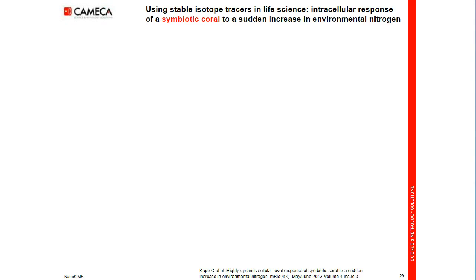In order to illustrate what the NanoSIMS can do in life science, I selected this paper issued from a collaboration between the Museum of Natural History in Paris and the EPFL in Lausanne, both equipped with NanoSIMS, working on coral and the symbiosis between coral and dinoflagellate symbionts.